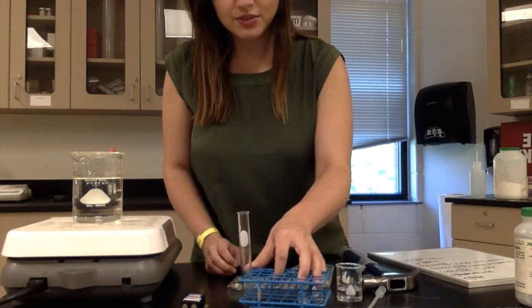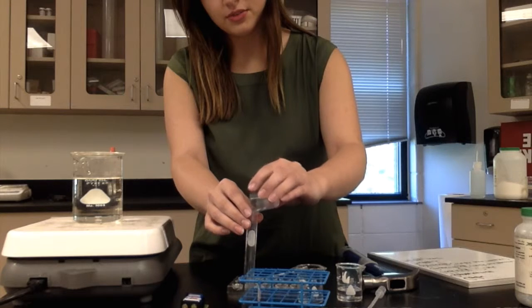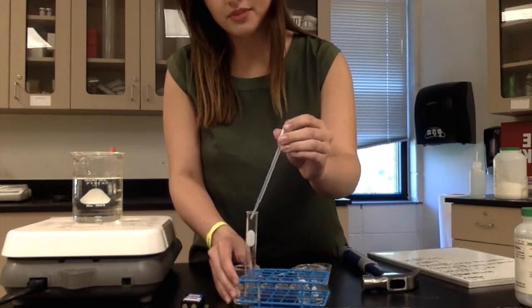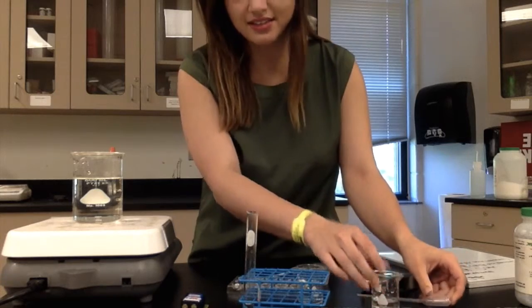Next, you take the test tube and the test tube rack, and you add a small bit of your sample to the test tube. And then you take a pipette and a sample of hexane and add 20 drops of hexane into the test tube to determine the solubility of the substance in hexane.